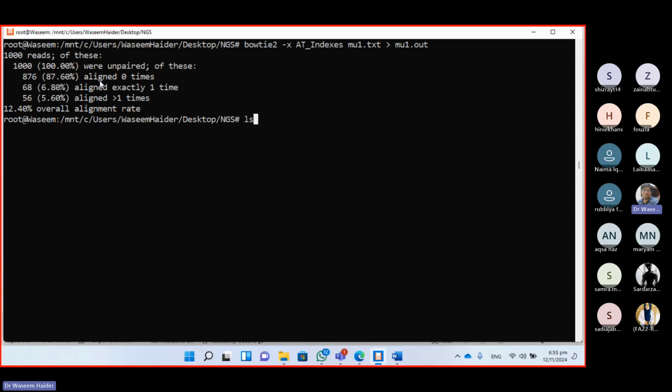The first assembly of soybean had lower alignment percentages because the number of transcripts was less, around 40,000, but in the second version they increased to 70,000. So obviously I got more search space, and more reads aligned, right? This is how we align those files.